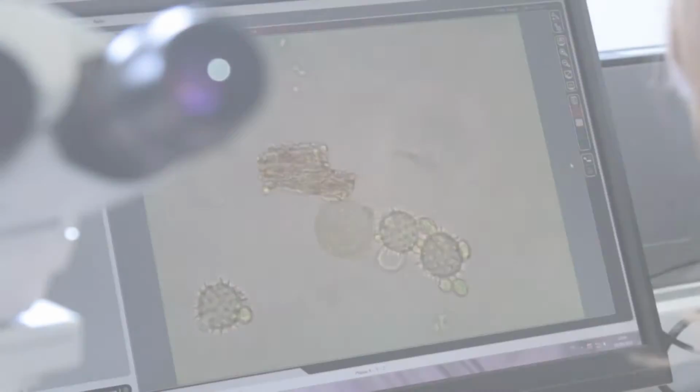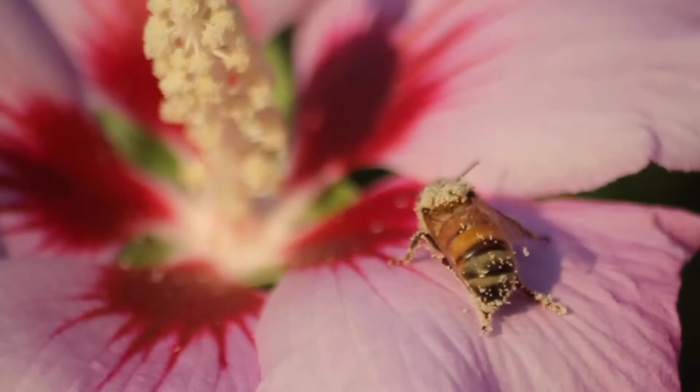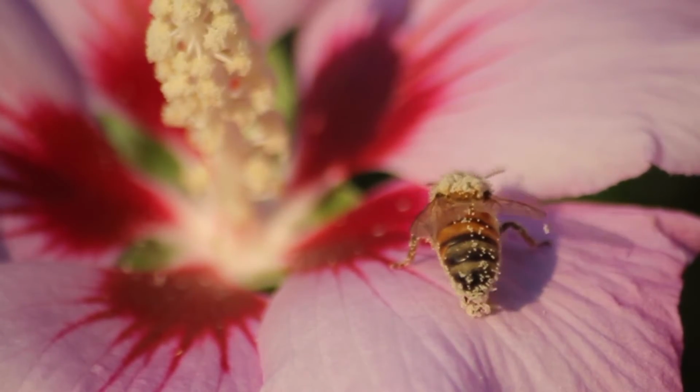origin of the sample. So today, in order to check the botanical and geographical origin, we are using the pollen present in the honey as a tracer. When the bees are collecting the nectar, they also collect some pollen grain. It represents perhaps 0.5% of the content of the honey. We extract this pollen grain and check it by microscopy. We identify and count it, and in this way we are able to attest the botanical and geographical origin.